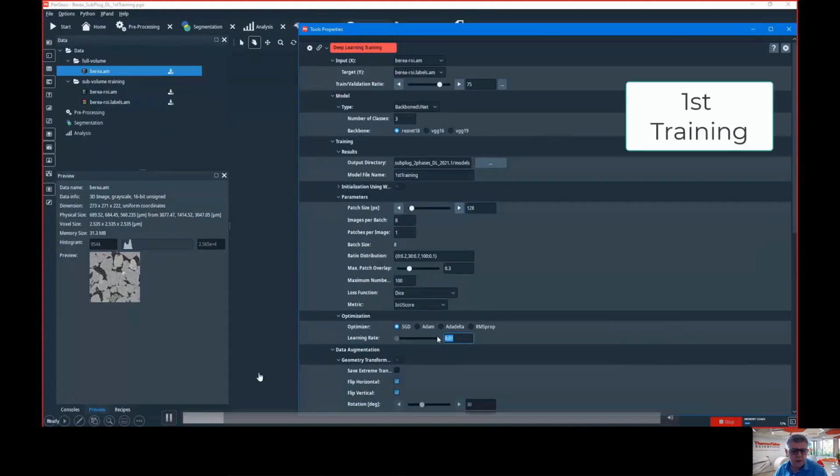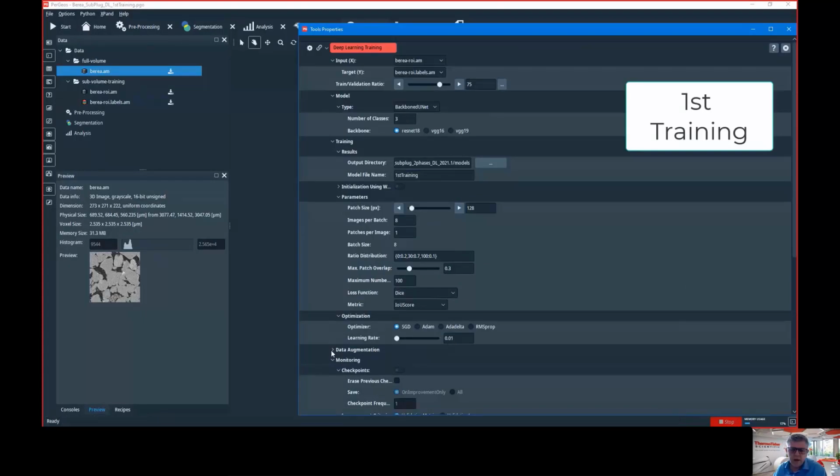You have plenty of parameters, but the tricky and most important ones are how many epochs and what the rate is, at which speed you want to go in the training. If you go too fast, you may lose the good path to convergence. If you go too slow, you're going to converge probably, but it's going to take a lot of time. So it's a small art to be able to set up these parameters. We teach this in the trainings. And if you have a data scientist, he already knows this story.